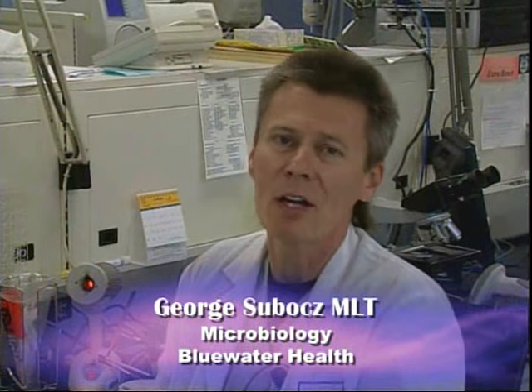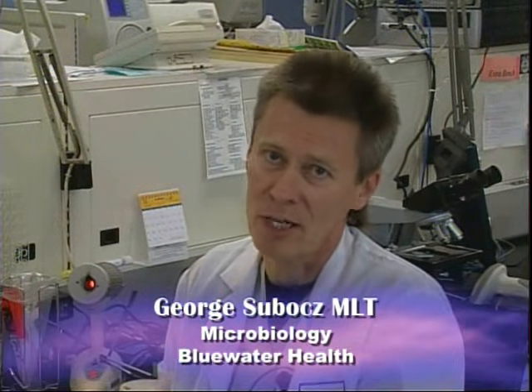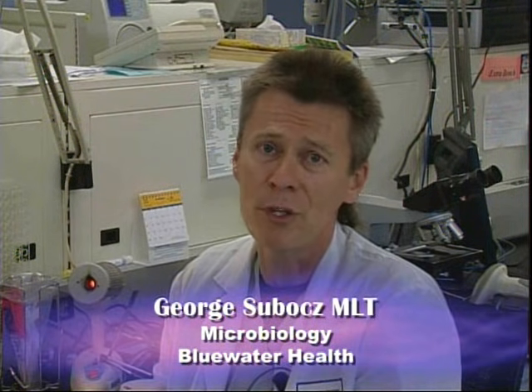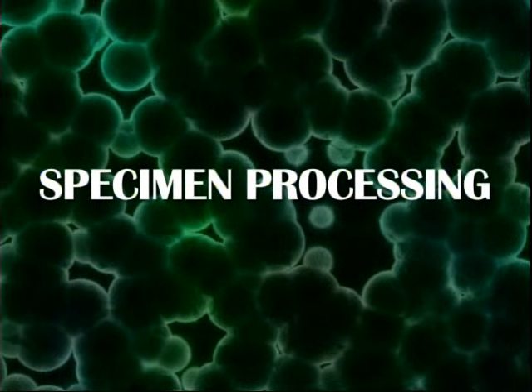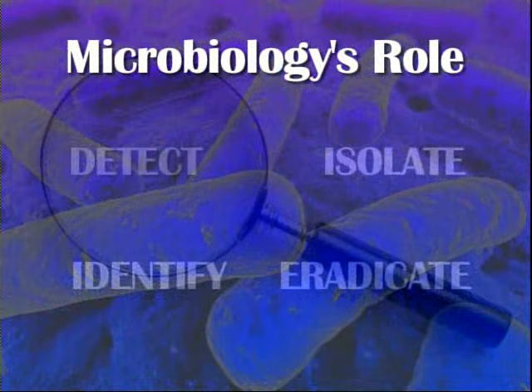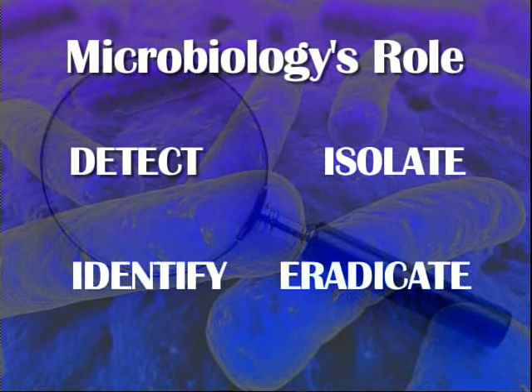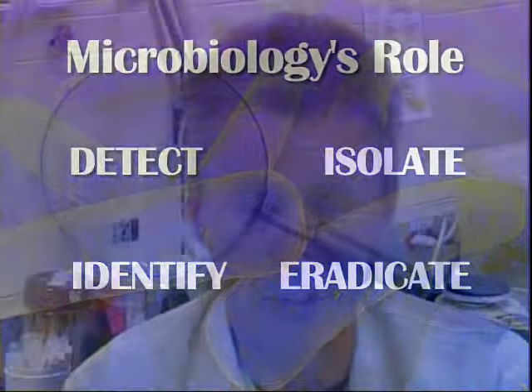I'm a medical lab technologist who works in a hospital microbiology department. I've been asked to give you a short overview of what we do here with the specimens that you'd send down for culture. We've been described as healthcare detectives, and our mission is to detect, to isolate, to identify, and to help eradicate those organisms that are causing infections in your patients.